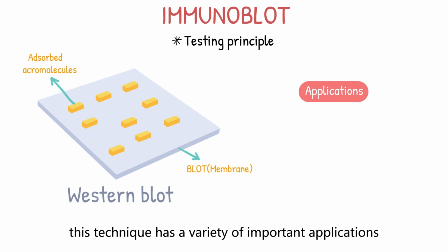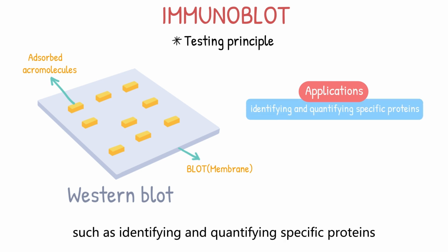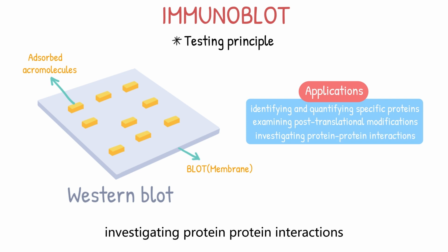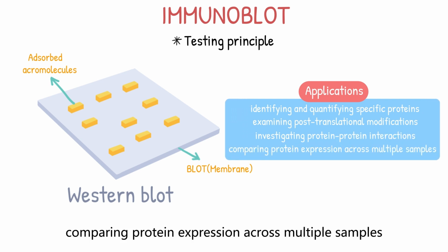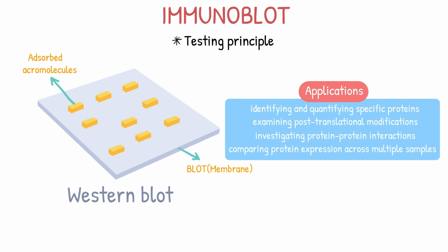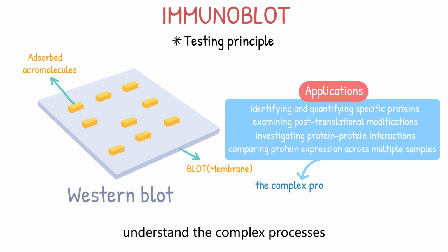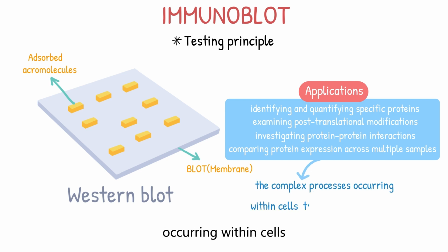This technique has a variety of important applications, such as identifying and quantifying specific proteins, examining post-translational modifications, investigating protein-protein interactions, and comparing protein expression across multiple samples. Through these applications, Western blot enables scientists to better understand the complex processes occurring within cells, tissues, and organisms.